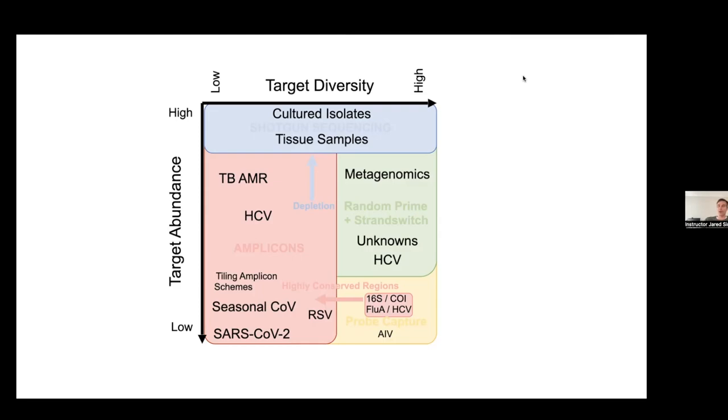I can't offhand remember or recommend a particular extraction kit, but if you're starting a new project where you're going to be sequencing a large number of pathogens, it's well worth testing out different extraction kits and seeing how well they recover viral material, how well that sequences, and whether you can recover the entire genome. So that's definitely important, but I can't make a definitive recommendation.